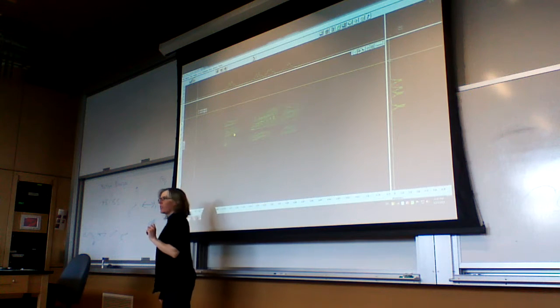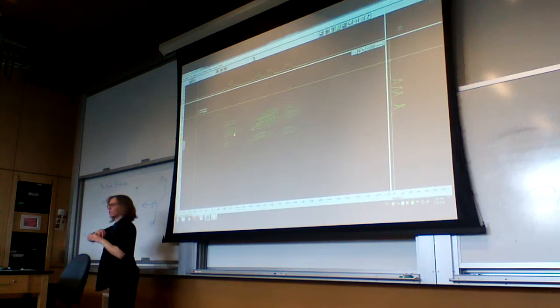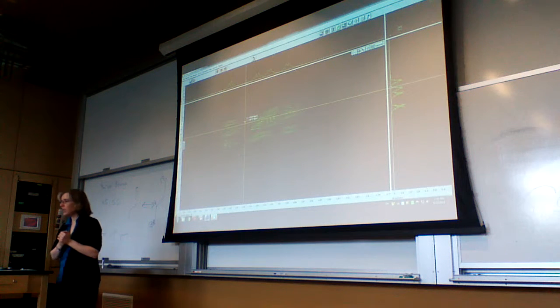And if you get high enough resolution, you'll see those side peaks so that you can actually see the coupling between E and F. So these correspond to a coupling between proton E and F. On either side, you could say it's that one, or this one, will correspond to the same coupling between E and F. So those at the diagonal you have to be careful with if you have peaks that are really close together.